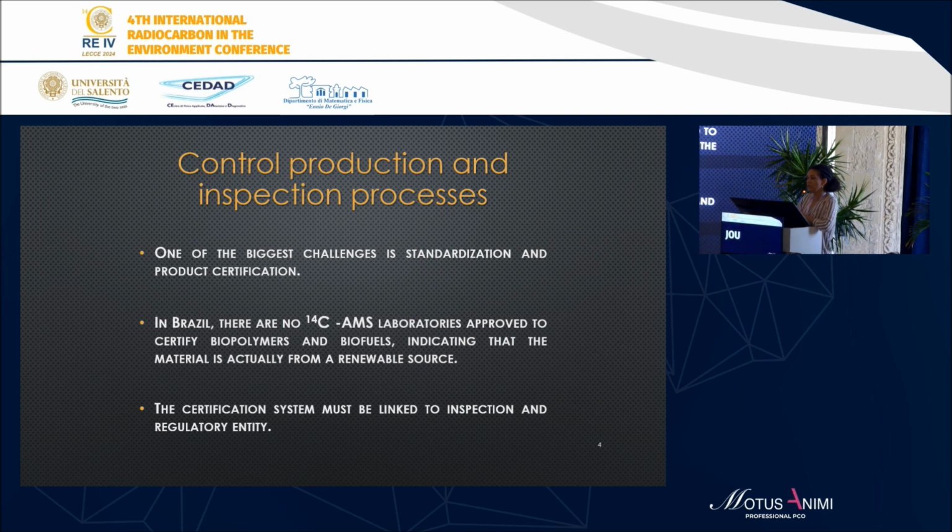In Brazil, we don't have an entity to monitor these biofuels. We do not yet have an approved laboratory to monitor this product. LAC UFF is the only radiocarbon laboratory with AMS in Brazil, and we try to help the government improve this scenario, because we have a lot of tax incentives to produce biofuels or bioplastics, but we don't have inspections.